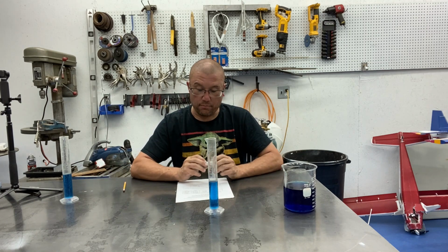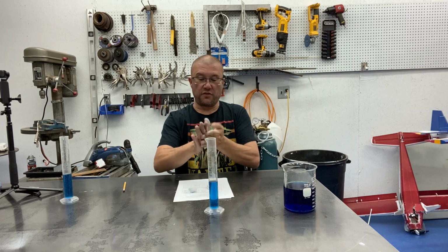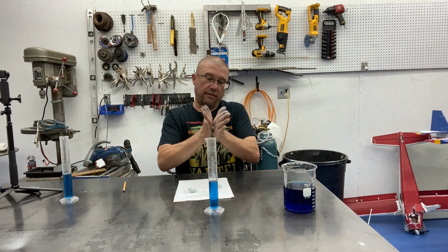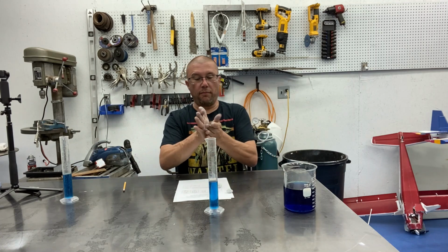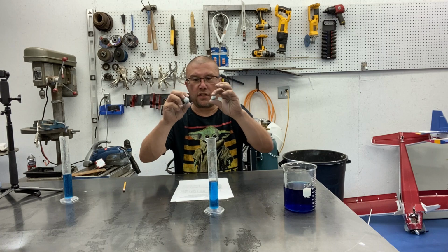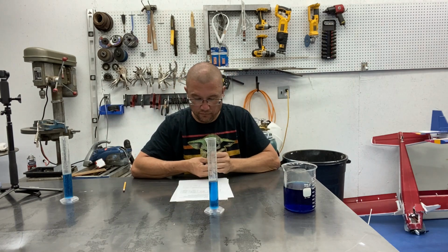Our next step, it says break and mold this clay into 3 separate spheres. So I'm just going to rip it apart and make 3 little spheres of clay. When we're doing so, we've got to make sure that they fit inside the graduated cylinder. They've got to be able to sink to the bottom so that we can get an accurate measurement of the volume. Now, this is the same piece of clay that we used for test 1. I haven't done anything other than change it by ripping it into 3 equal or somewhat equal sized spheres.